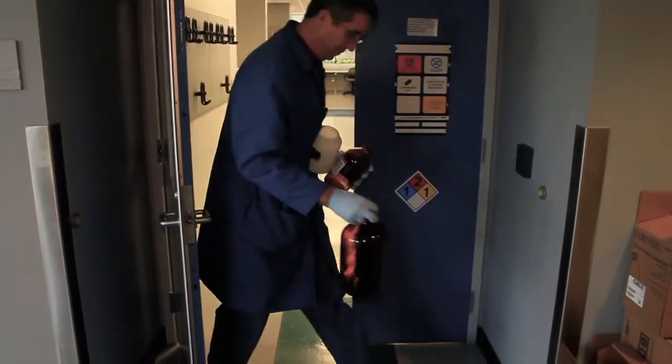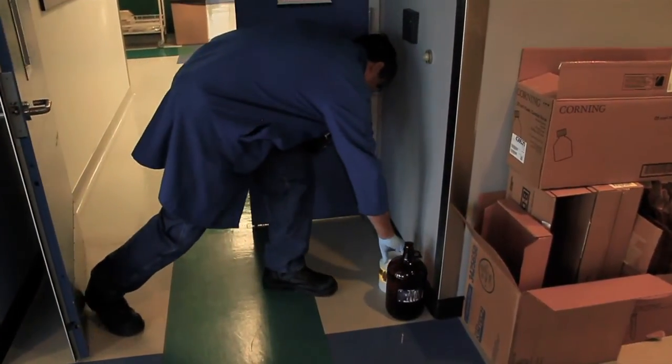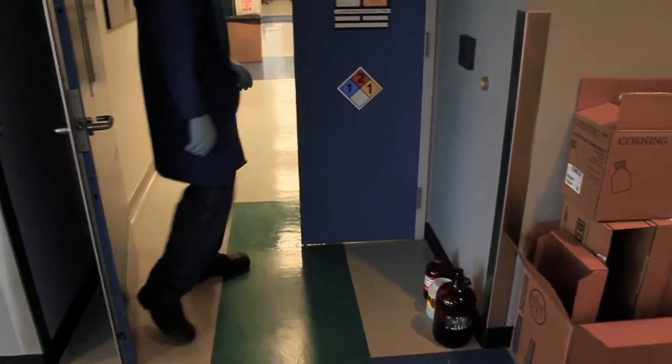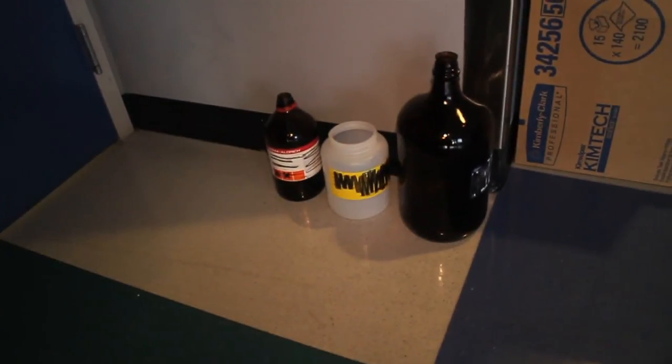Place these bottles in the hallway outside your lab and the janitorial staff will come by and pick them up. Remember, the janitorial staff will only pick up clean, dry, defaced chemical bottles without a lid.